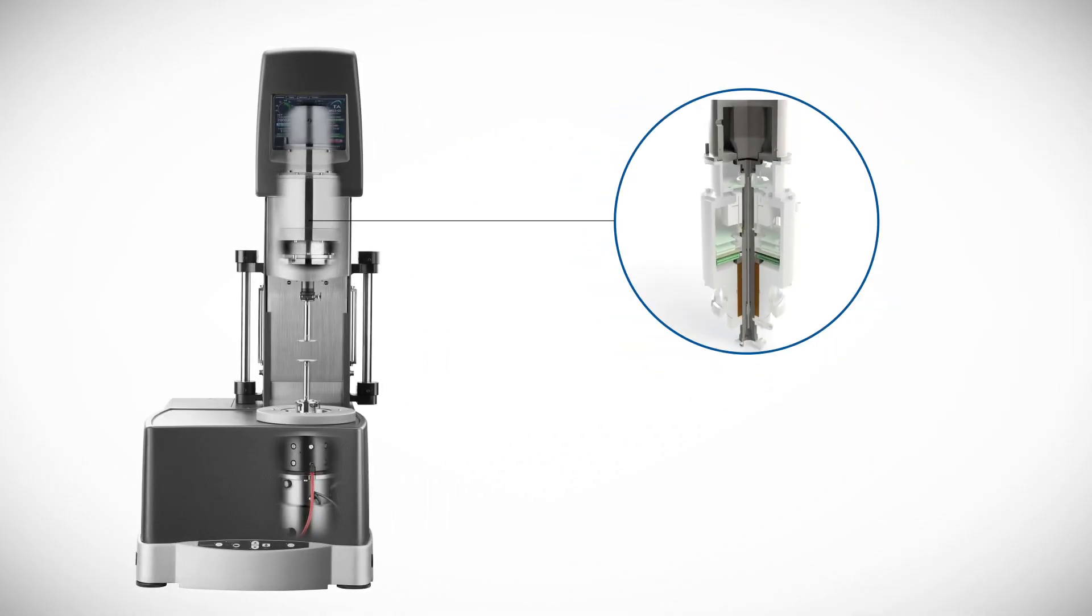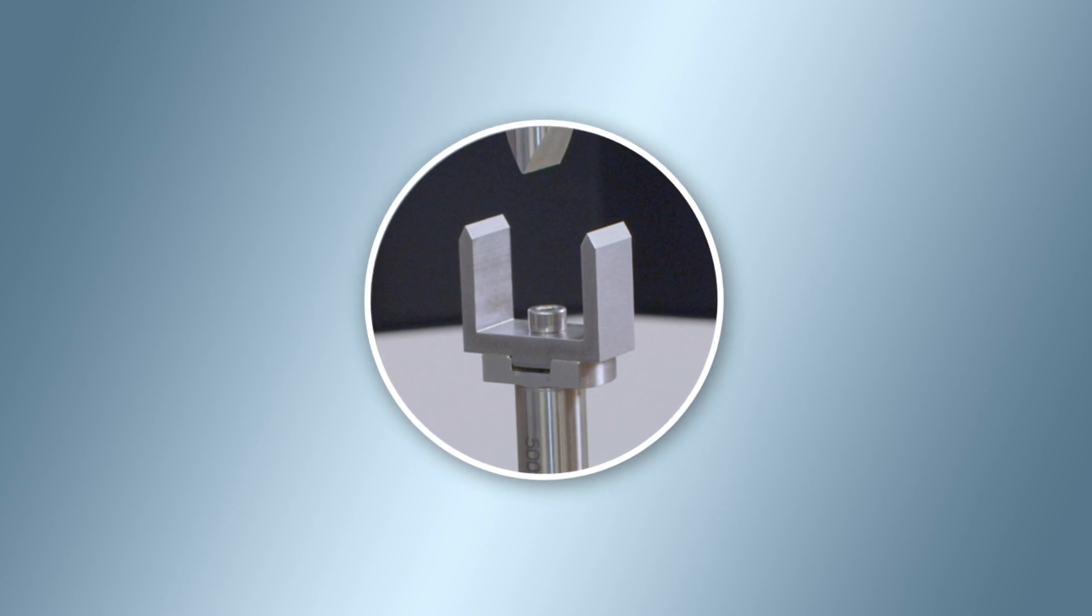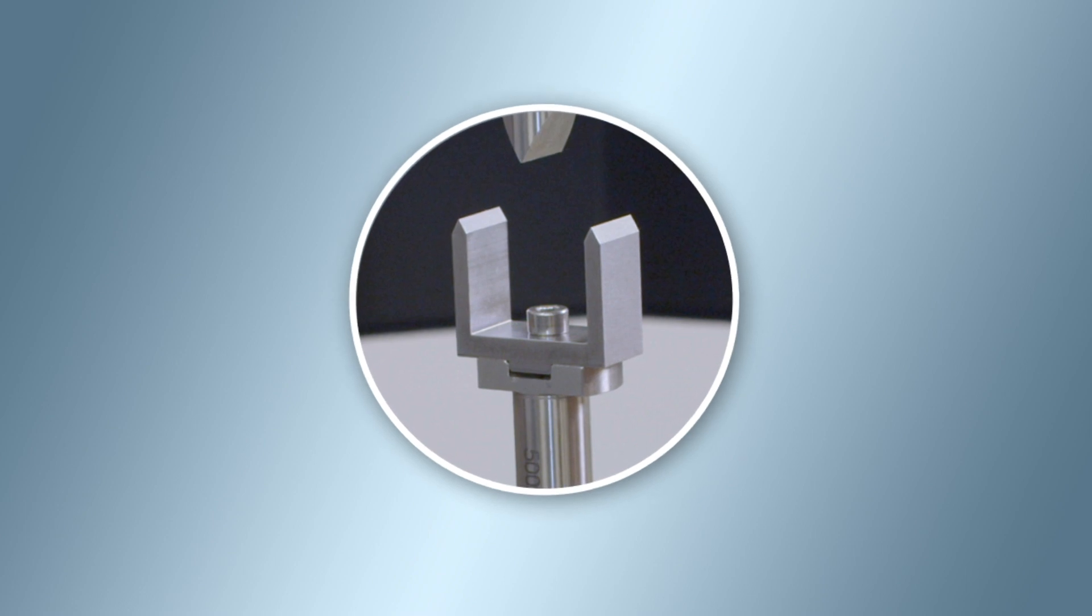Using the force rebalance transducer, the ARES-G2 is a rotational rheometer capable of performing linear dynamic mechanical analysis. The three-point bending clamp can be used to study viscoelastic properties of a solid rectangular specimen in bending mode.